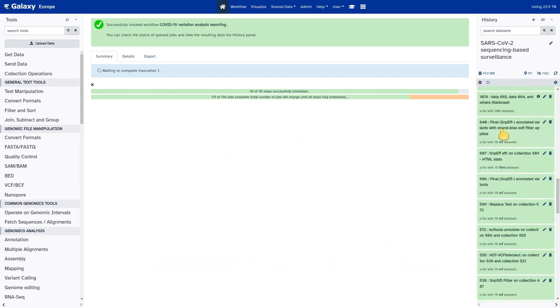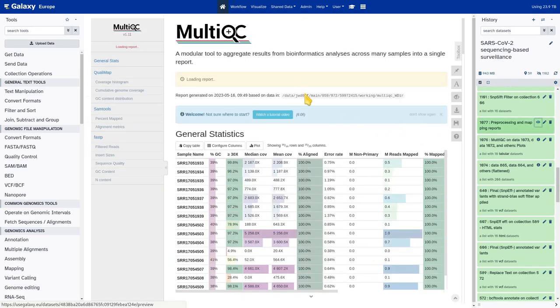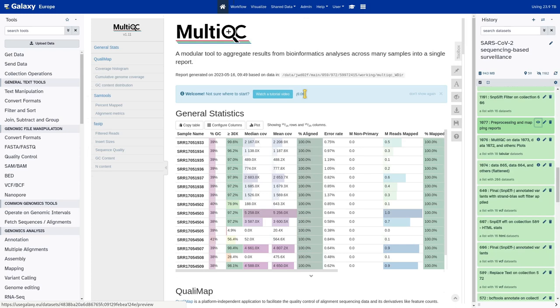SnpEff also does the questionable strand-bias soft filtering — which is the experimental filter we said we'd ignore. Finally, from all the different mapping and read quality metrics produced along the way, we produce the final pre-processing and mapping report. We can look at it right now by clicking the display icon, which opens the MultiQC report on all the different quality statistics obtained throughout this workflow. It's really advisable that for each batch of data you at least take a brief look at this report to see if there was any trouble with any of the samples.